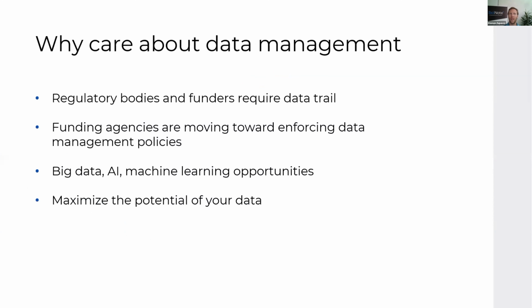Well, first of all, whoever is your regulatory body or your funding agency, they'll definitely want more. We see the trend, they'll want more data management from your side, particularly in the digital sense. We see a huge trend with funding agencies requiring scientists to have data stored in certain ways.